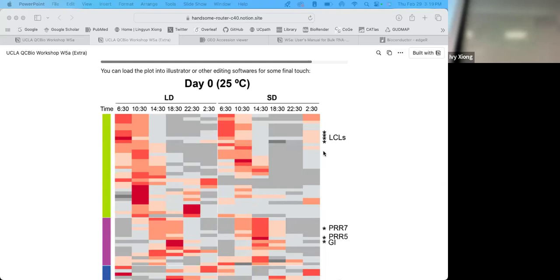Do you get it to space? I got it from the Google. Yeah, it should be the same, and it's the same file name. That's a mystery. Your grays and the stuff are also different, which is not surprising. Yeah, I feel like you're applying with different names. Interesting. Do you have your tree? We can look at your original tree. Yeah, I found the wrong one.